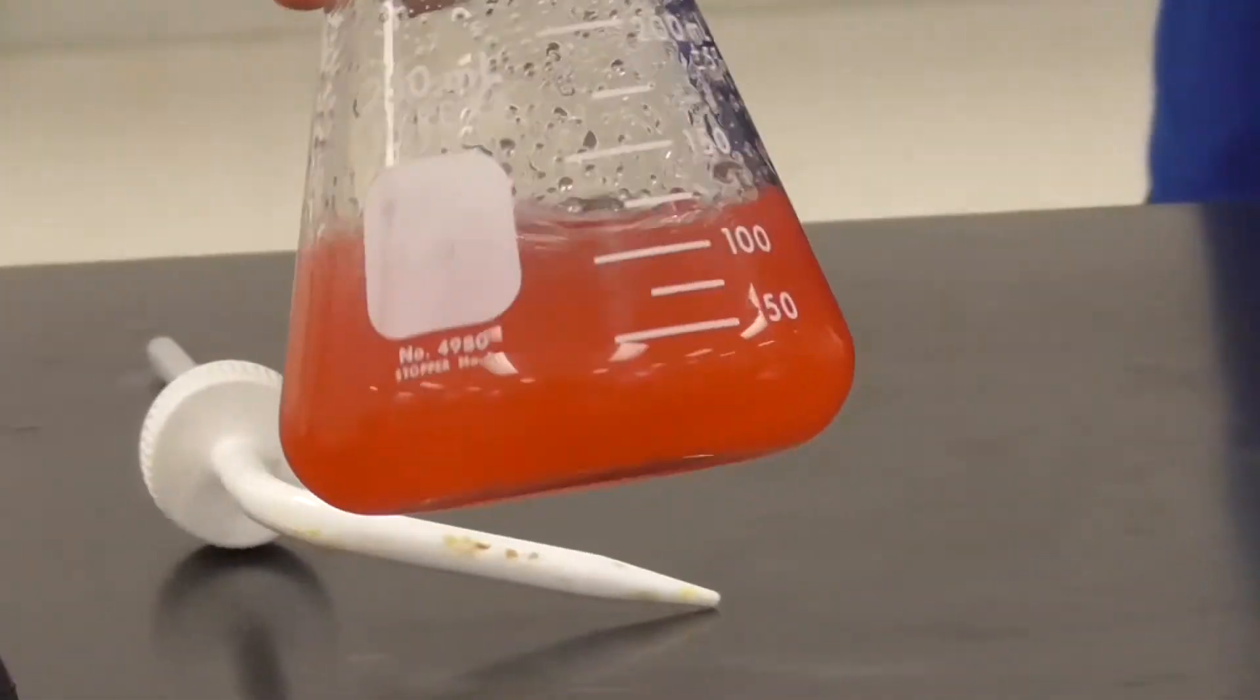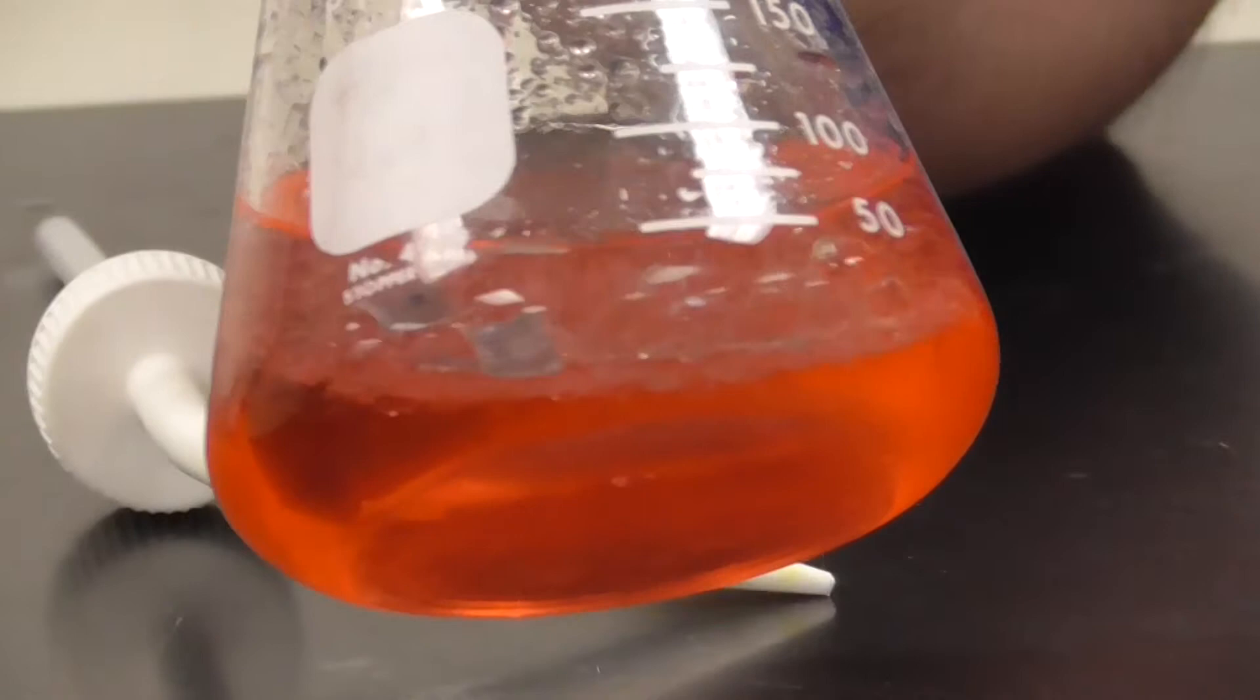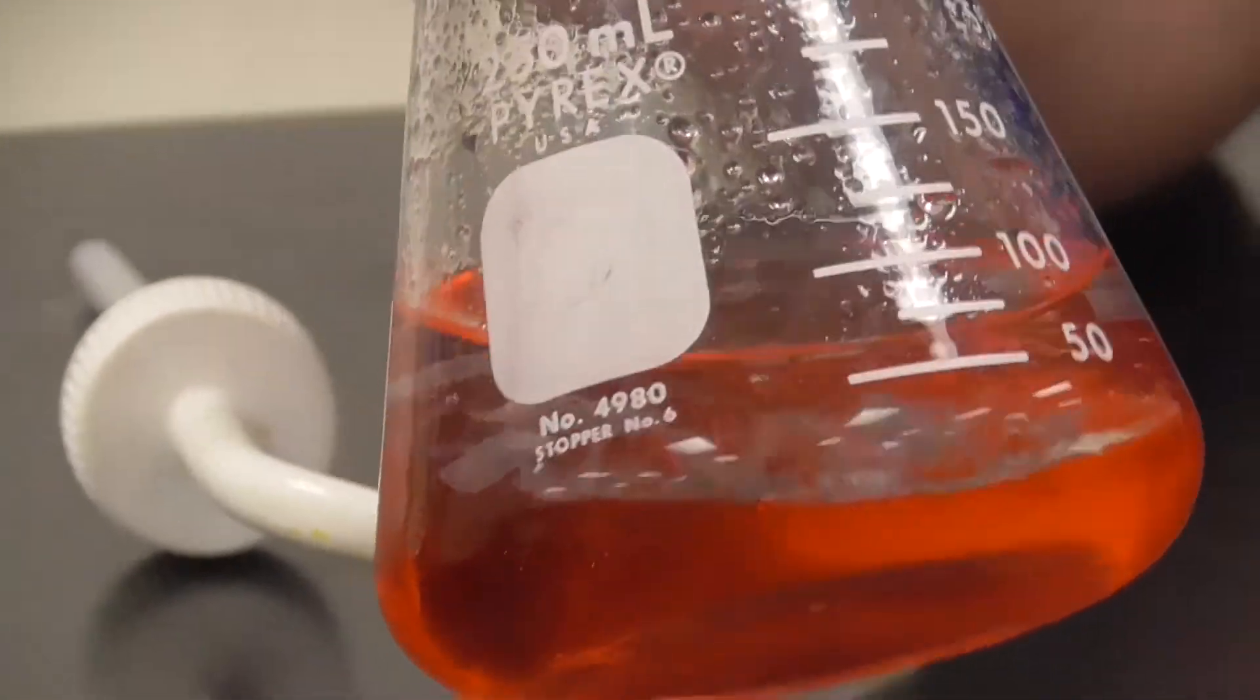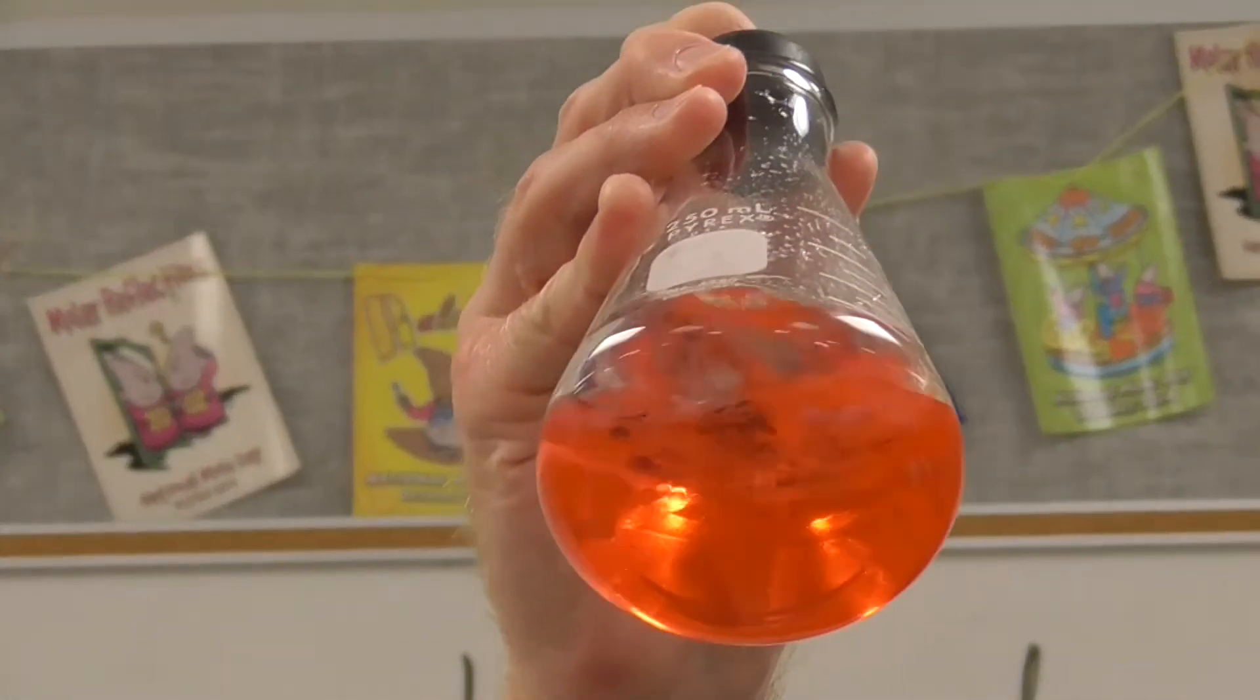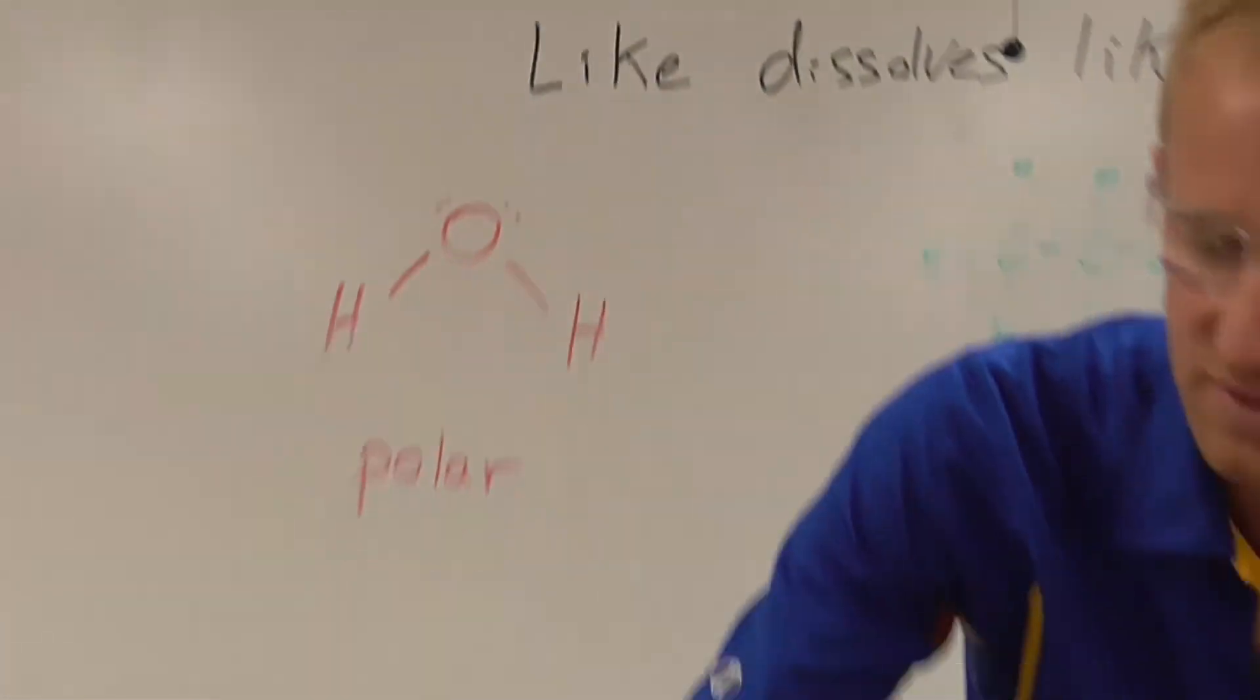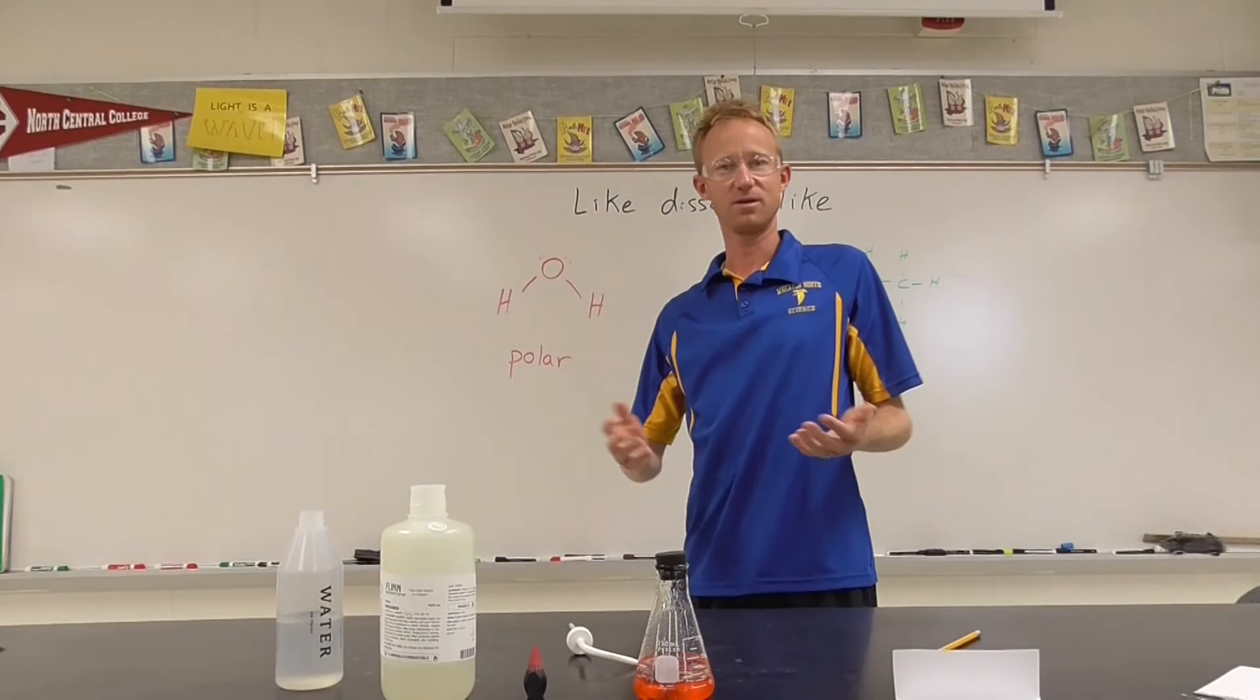If we were to shake it again, we would have the same results. All of the graphite, which is non-polar, orients itself towards the non-polar hexane. And if you look underneath, the cellulose side of the paper is all oriented with the water. So the purpose of this demonstration is to provide some evidence that like dissolves like.